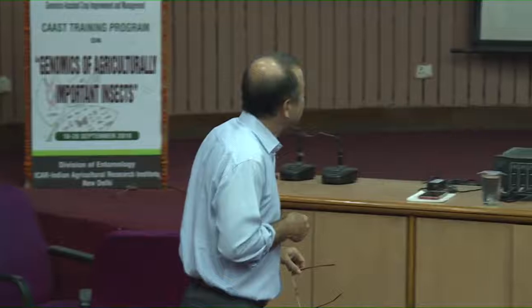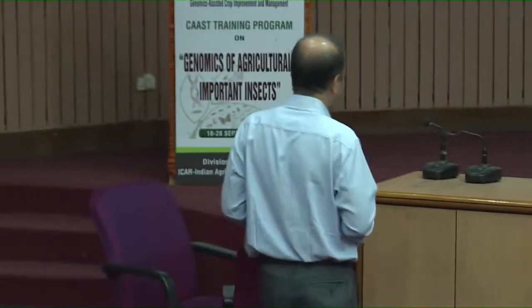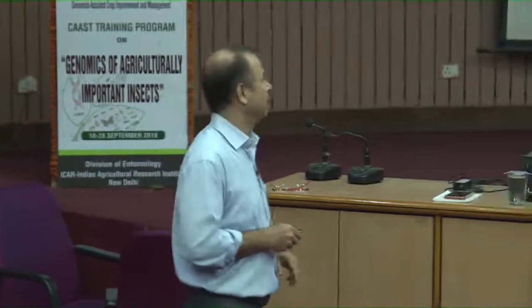But all these things will be done by the machine. Until and unless you are clear in the basics, you will not be able to properly handle the machine. The machine does not have its own intelligence, you have to dictate it, is it not? So, you have to understand what you have to do, and accordingly you ask the machine to calculate all the values and show you.